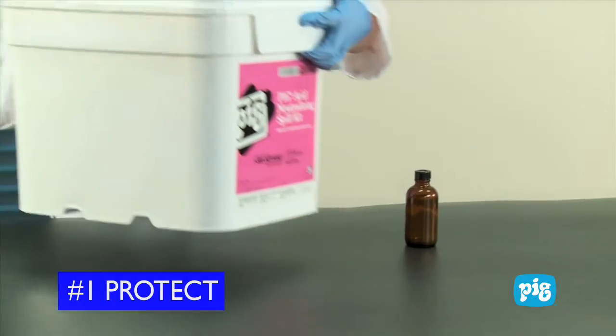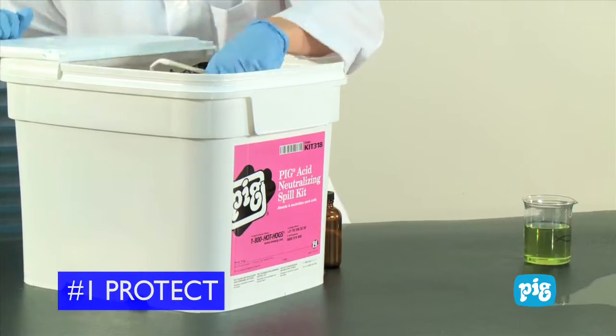Step 1: Protect yourself. Put on appropriate PPE before responding to the spill.